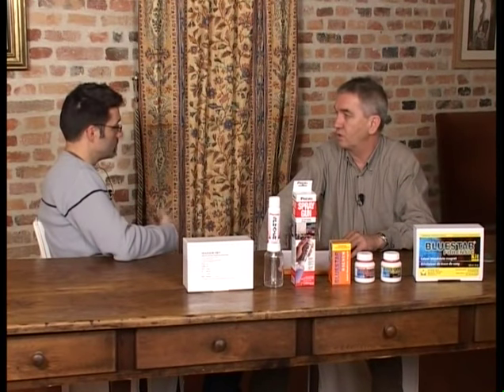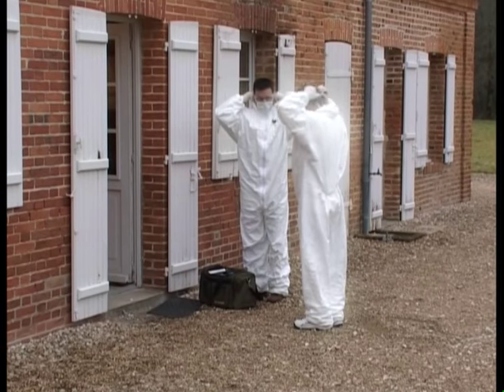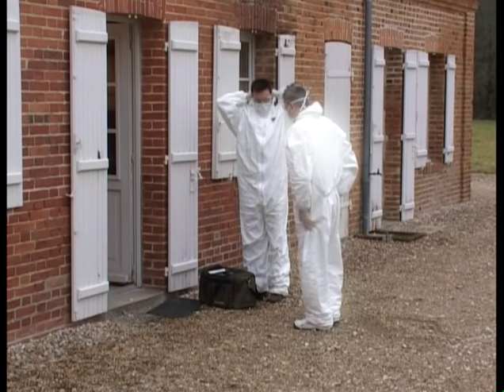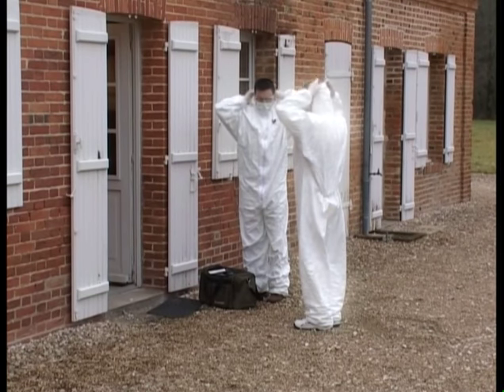So there is no particular danger for the technician using it in the field. No. And he is protected by the clothing that he must wear anyway when managing the crime scene. No need for extra protection, nothing more than what he wears usually on a crime scene.